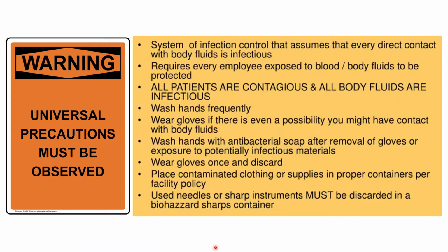There could also be compressed gases, flammable liquids, radioactive material, and corrosive substances. There can also be mechanical trauma because we use needles and sharps inside the laboratory. So when we have a needle prick, that's considered a mechanical trauma. Also poisons and the inherent risk of handling the different biologic materials. That's just to name a few of the potential hazards found in the laboratory.